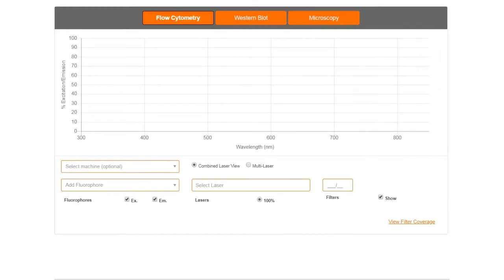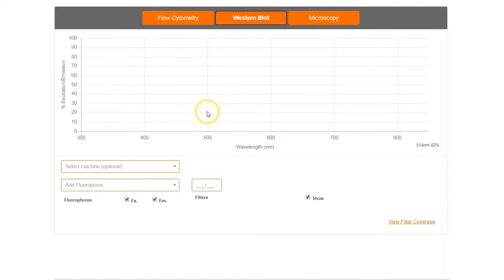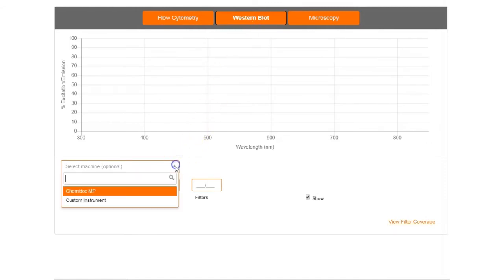Bio-Rad's spectra viewer supports three applications: flow cytometry, western blot, and microscopy in a single tool. Use the appropriate button to select your desired application.